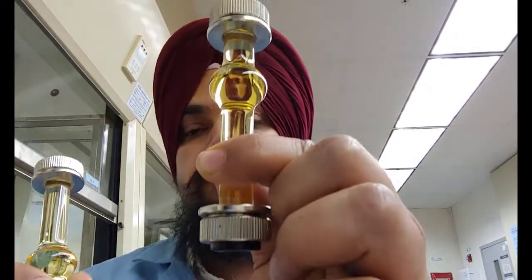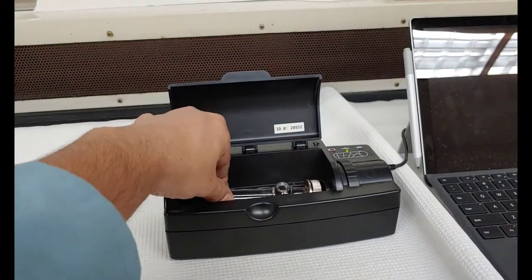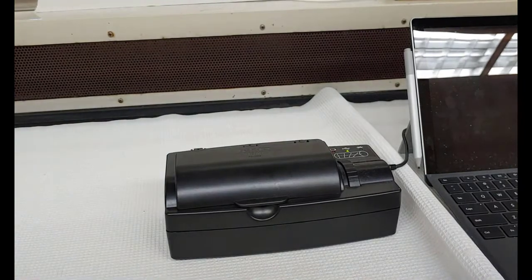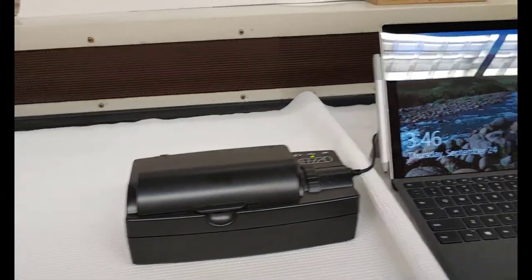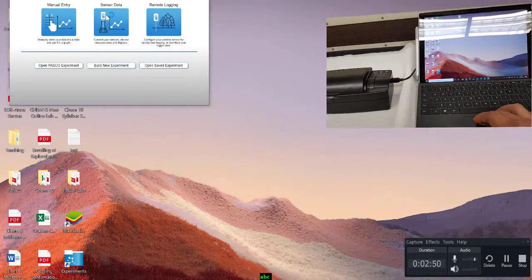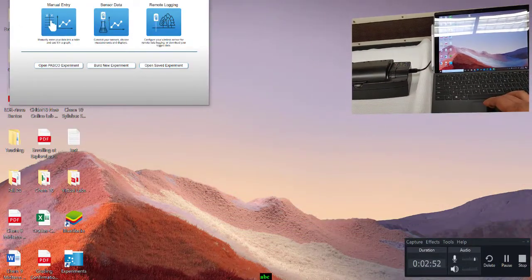The positive one is going to rotate the light to the positive direction, or it's also called dextrorotatory. The negative Carvone will rotate the light to the negative direction. So let's test it with the help of the polarimeter. So you put your sample in here, and then you close it, and then you go to your computer and open the software and continue the experiment.